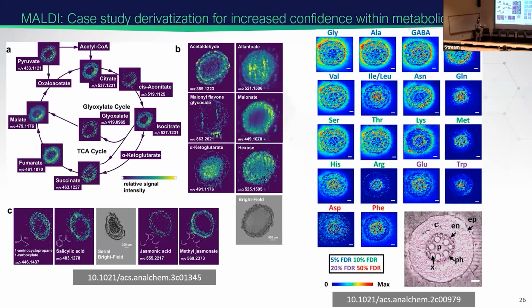We can not only do metabolomics, lipidomics, and spatial proteomics, we can actually start profiling the cycles, the amino acid metabolism, looking at the TCA cycle, seeing how energy is transferred. And if we're thinking about different plants and microbes, carbon sequestration and nitrogen uptake, getting at these real biomolecular mechanisms under nitrogen fixation or anything in between. We can have pretty high confidence within this metabolic profiling, especially adding these tags to them.